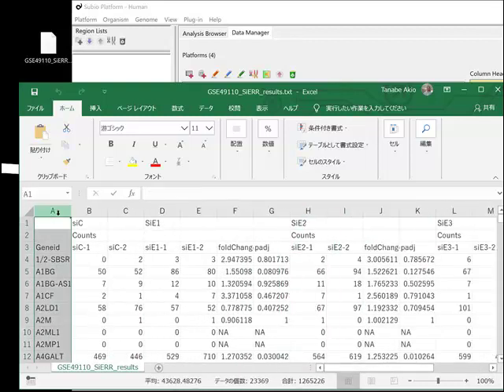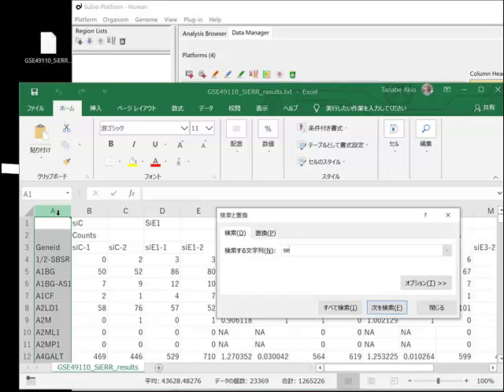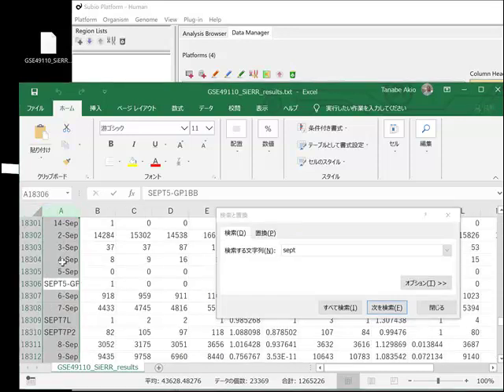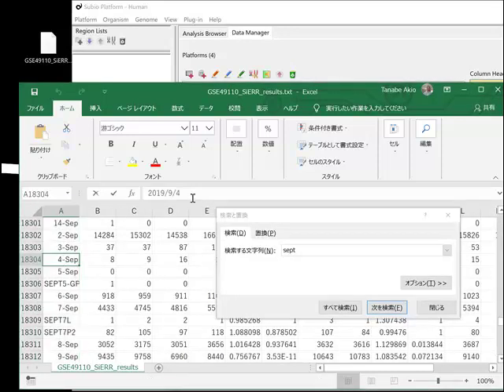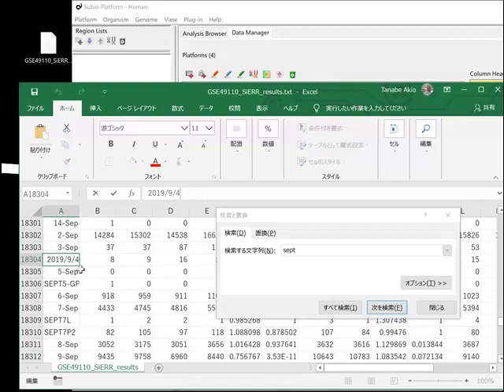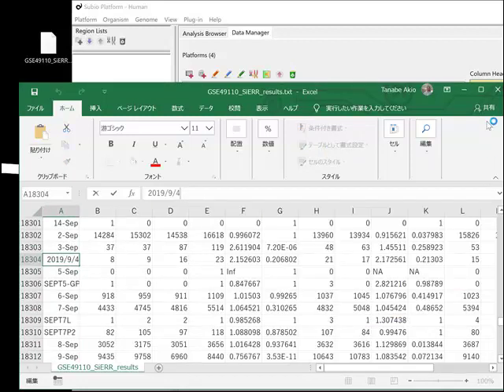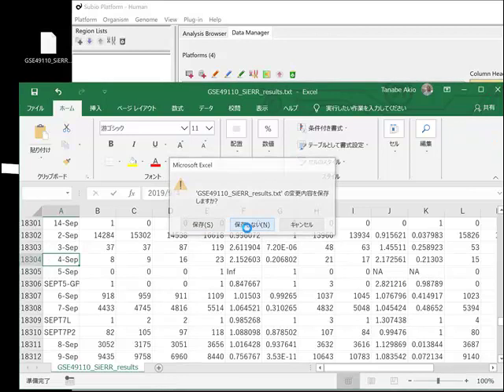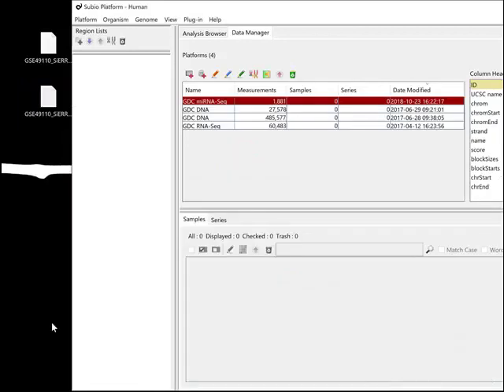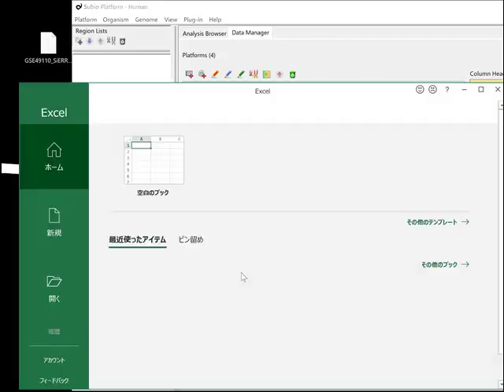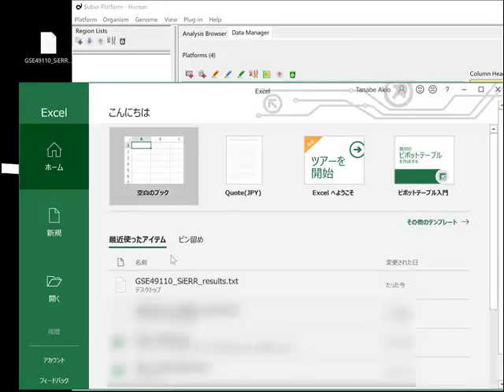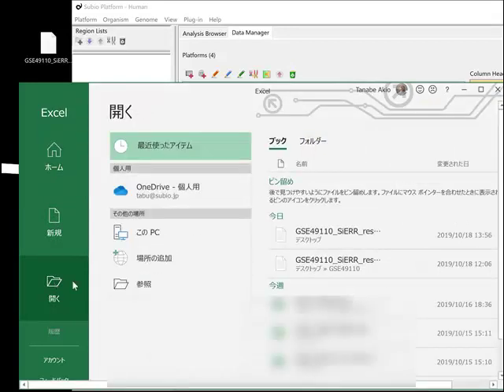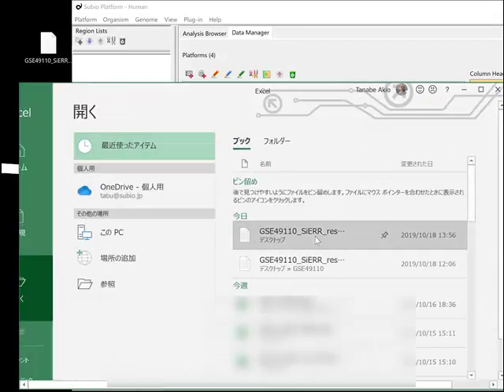If you open the file in the usual way, Excel converts gene symbols like CEPT1 to dates. So you have to open the file this way to have Excel recognize gene symbols as text.